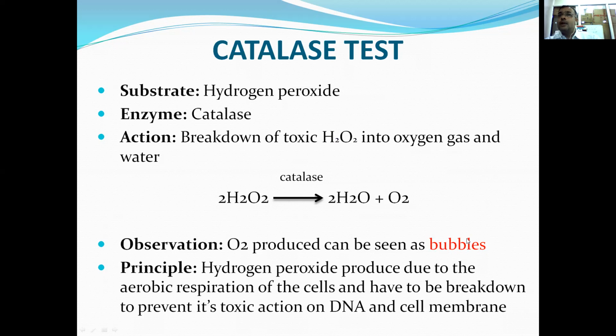So in KOH, there is a string formation. In catalase, there is a bubble formation. Now you have to be very conscious, because this bubble formation is for a short fraction of time. If you are chatting with your friend while mixing, you may miss the bubble formation and give a false negative result.